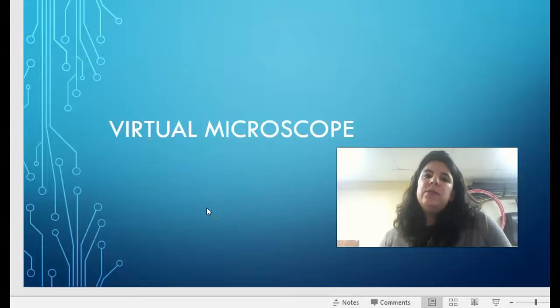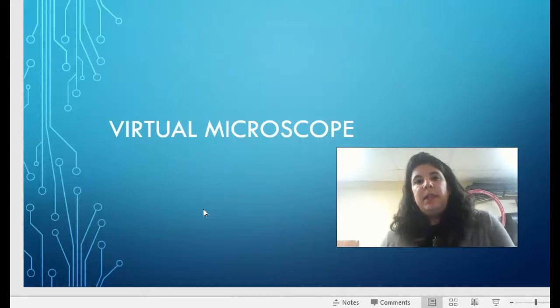Morning. This week you're going to be doing a virtual microscope lab. Obviously we aren't meeting in person, so we can't play with the microscopes in a hands-on situation. So we're going to use an online simulation to help you get acquainted with the parts of the microscope and some of the ways in which the microscope functions.